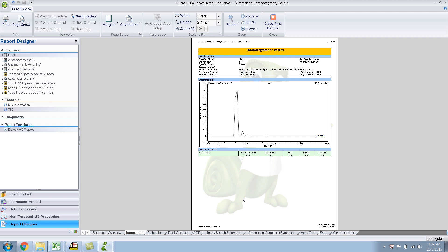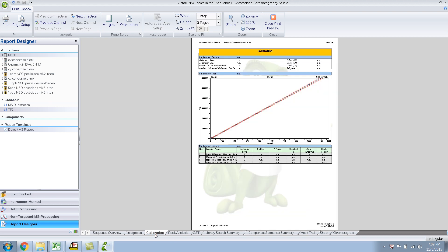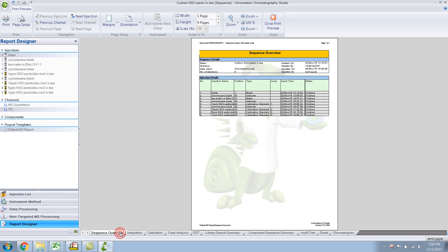So one of the questions that I got asked the other day was how do you remove this? I don't want this watermark on each and every page of my report. So how do you do that?